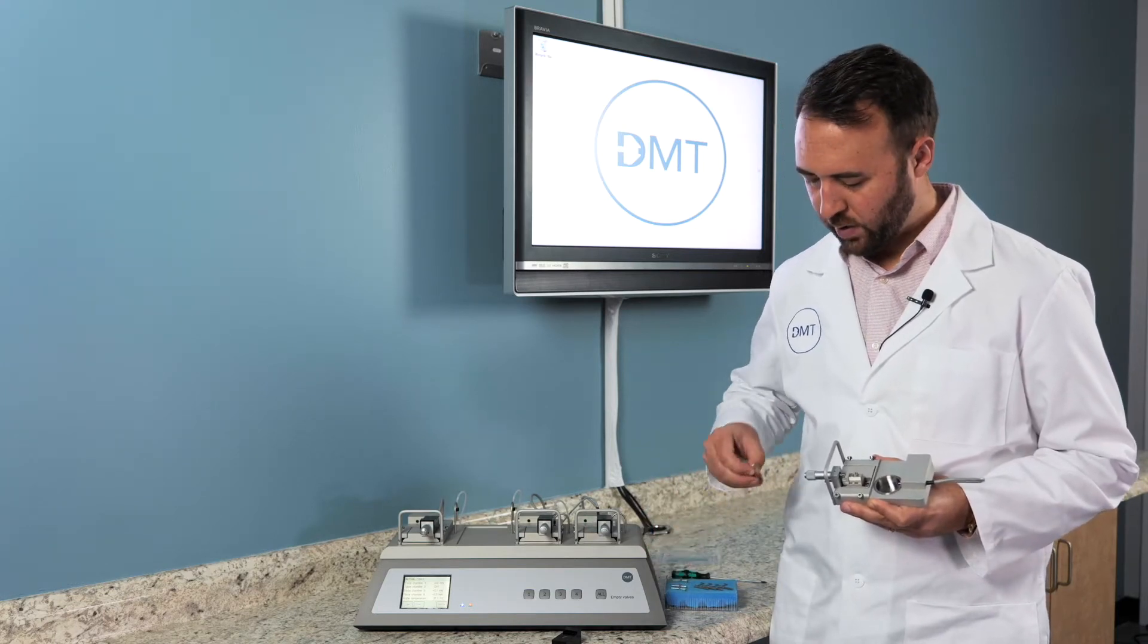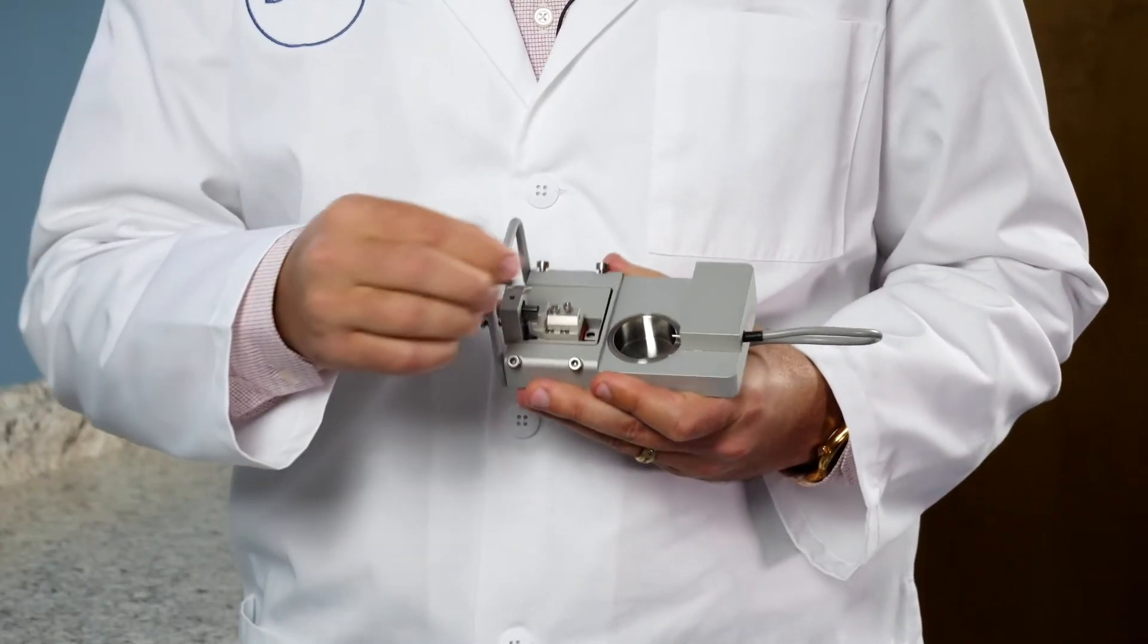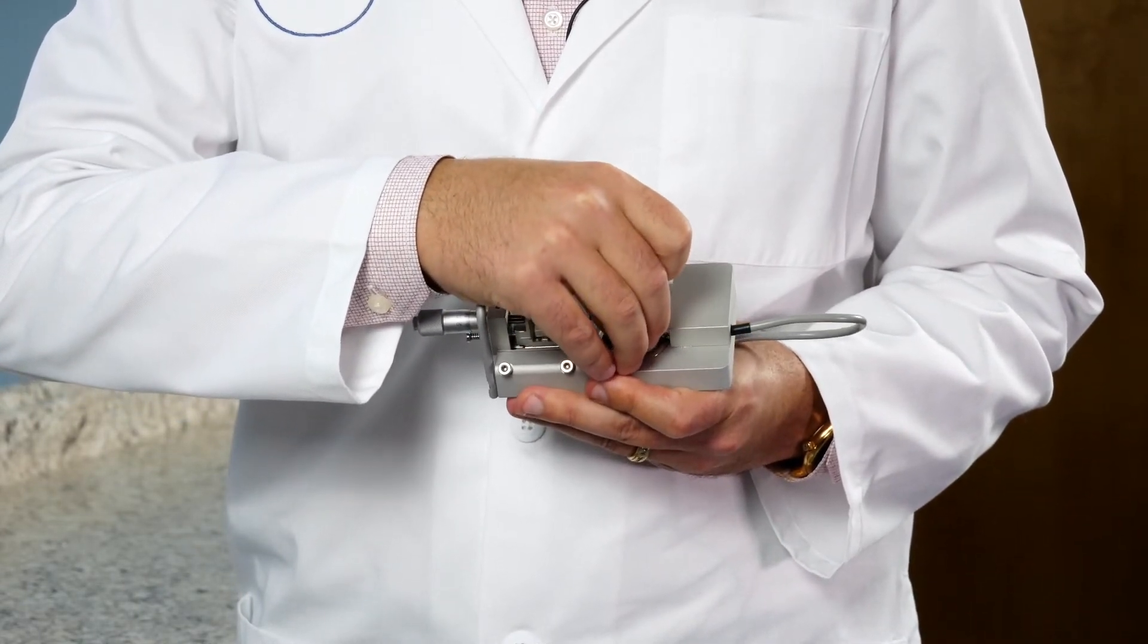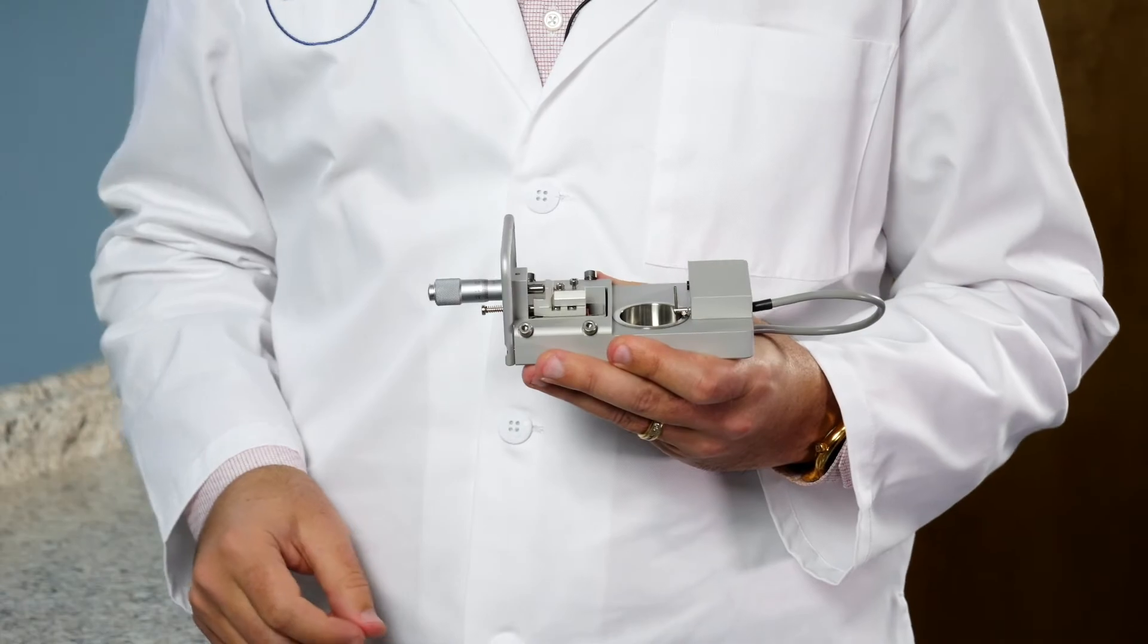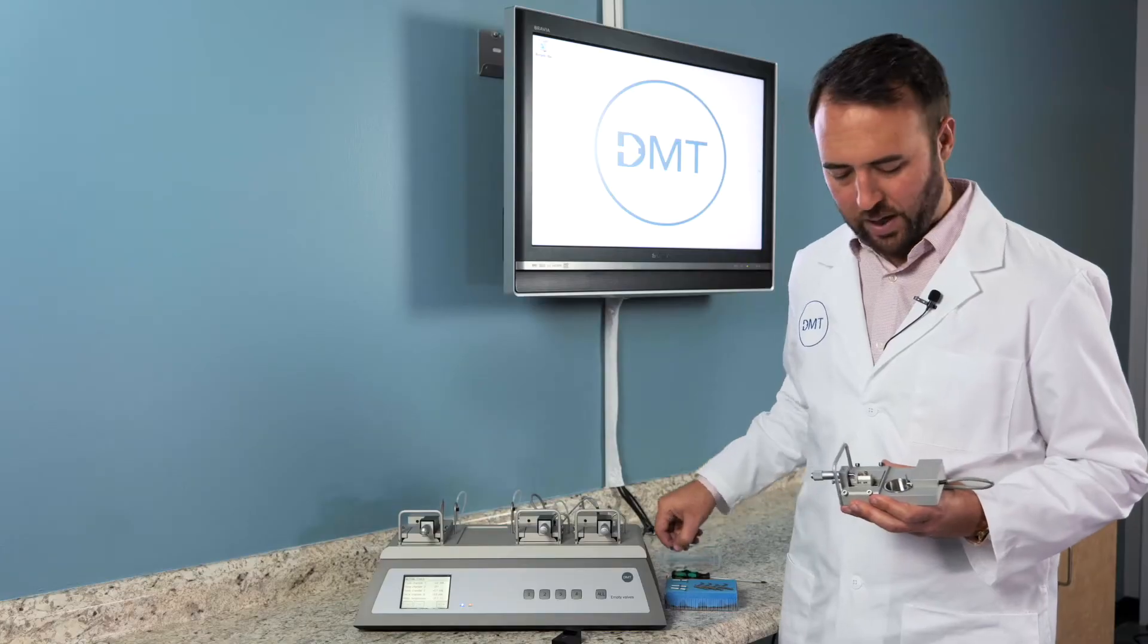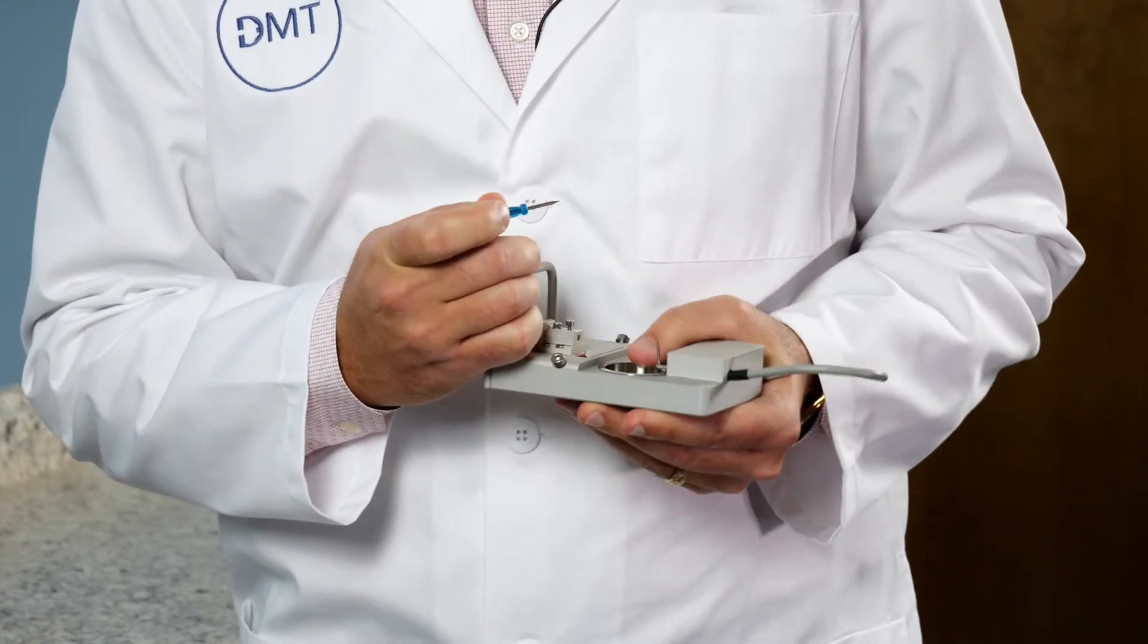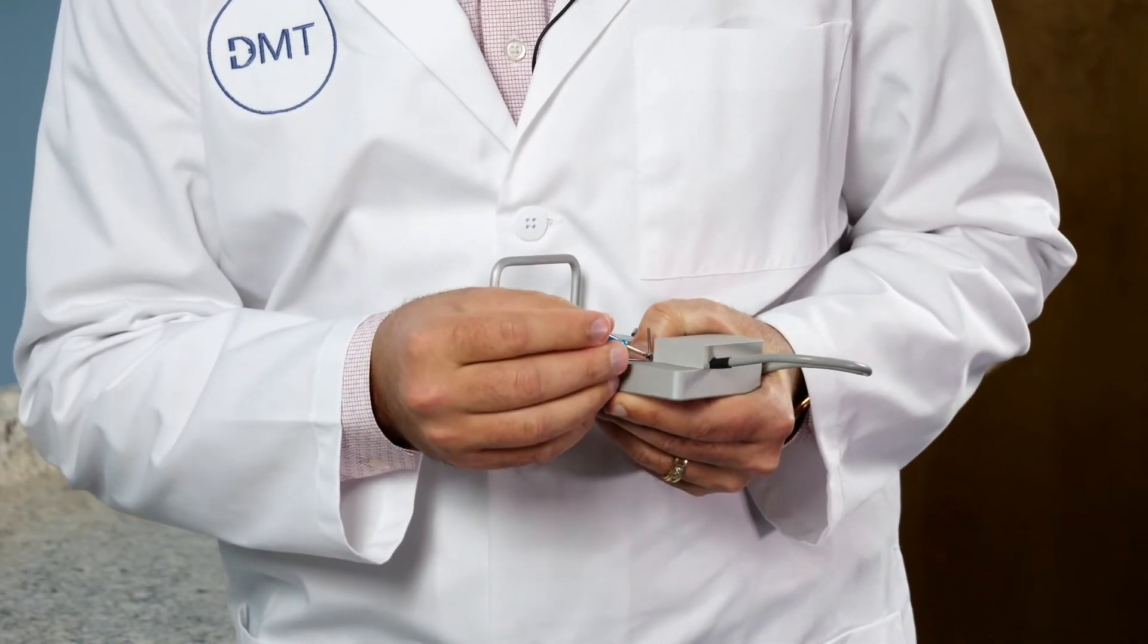So first, we will get the smaller pin, which will connect to the force transducer arm itself. So you will slide that over the arm and you will take your small screwdriver and again tighten the back screw.